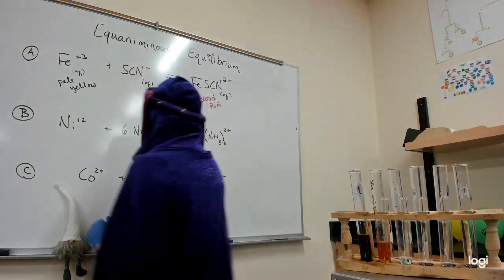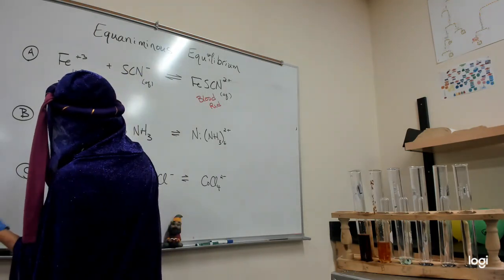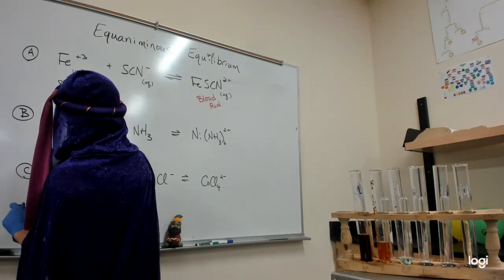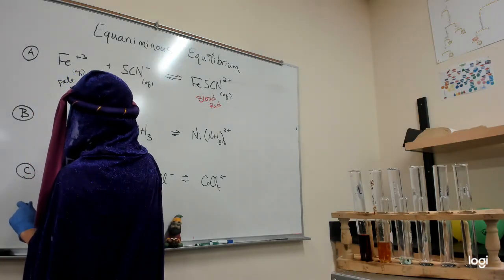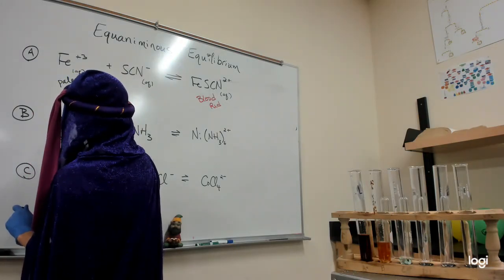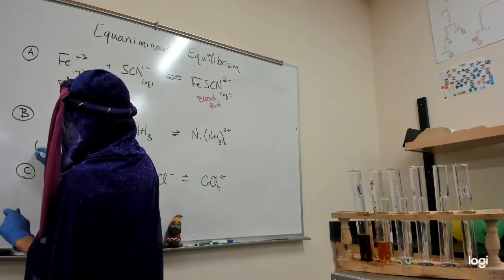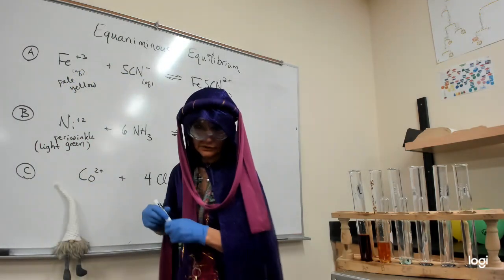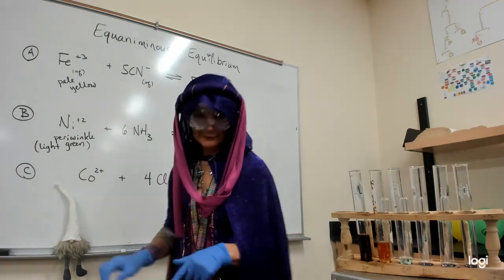Let's write our colors up there. So, is that periwinkle? I think so. Which is a light green, for those of you who don't know your color scale, which could be your teacher.